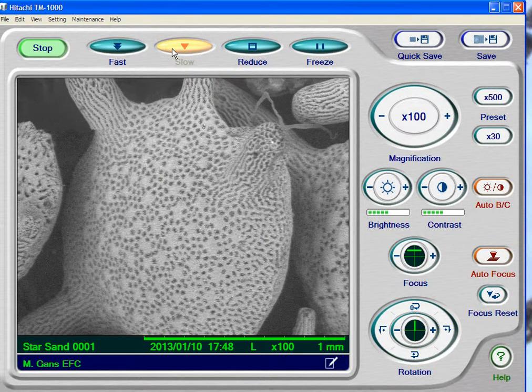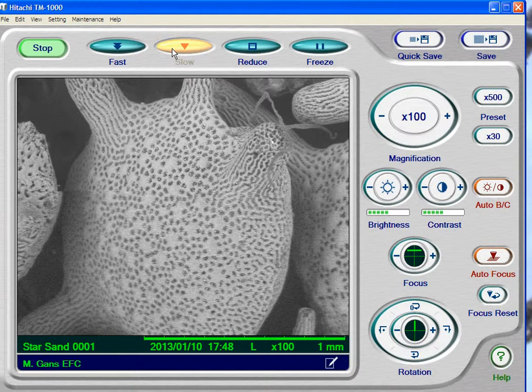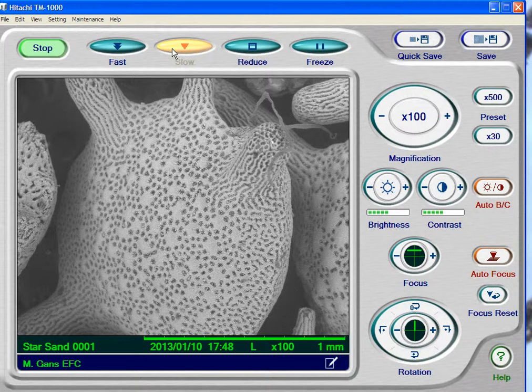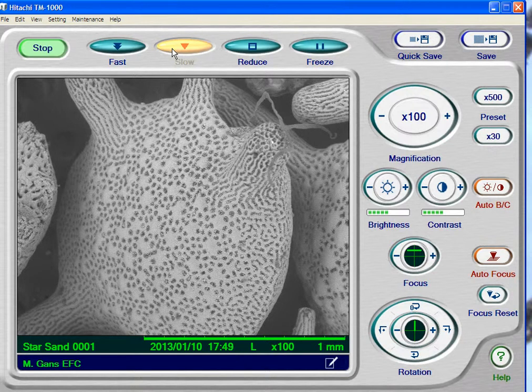And here's why. The way we make a picture with the microscope, if you recall, is that the electrons are hitting the specimen and causing the specimen to actually give off its own electrons, which are picked up by the detector. The longer the electron beam is on any particular point, the more electrons we get out of it and the more information we get. Of course, there's a downside to that — you can actually overcharge something with the electron beam, but that's the reason.